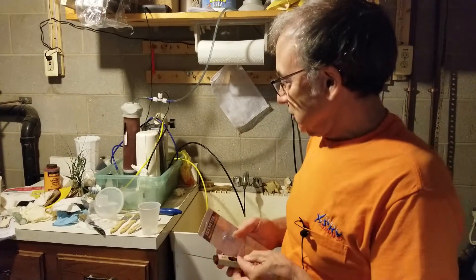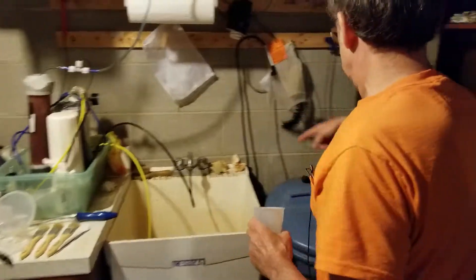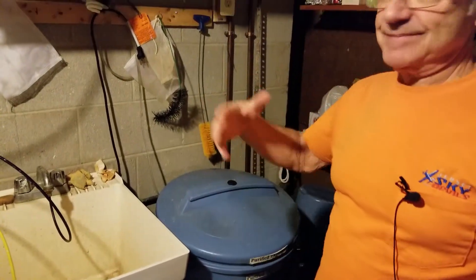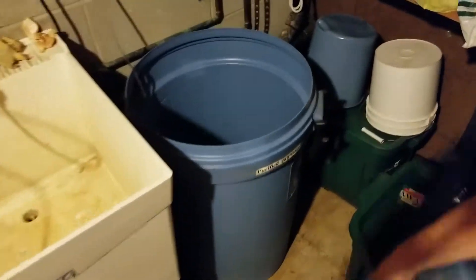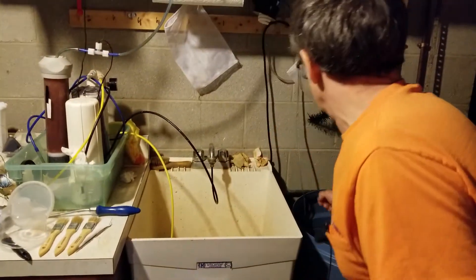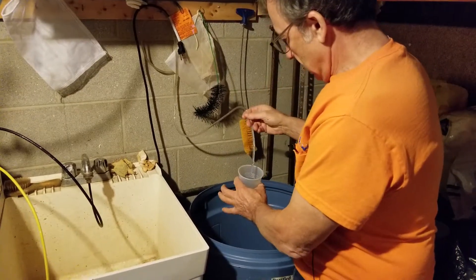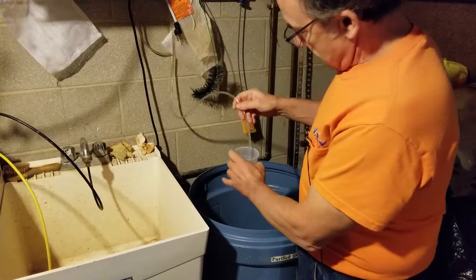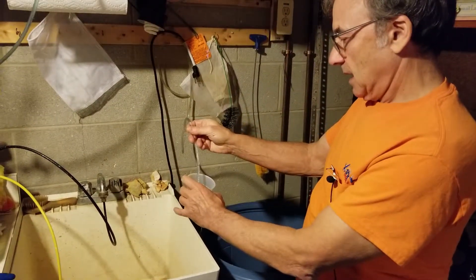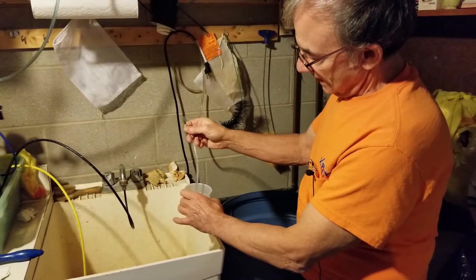I'm going to take this out of the package and set it aside for a minute. I'm in the process of filtering water because I just replaced some evaporated water loss in my reef tank and I need to replace water from my 30-gallon clean water reservoir. This is the water that's coming out — we'll let this fill up into the cup. This is straight out of the filter, and when I get it to about two inches high I'll put that meter in and measure how well the filter is working.